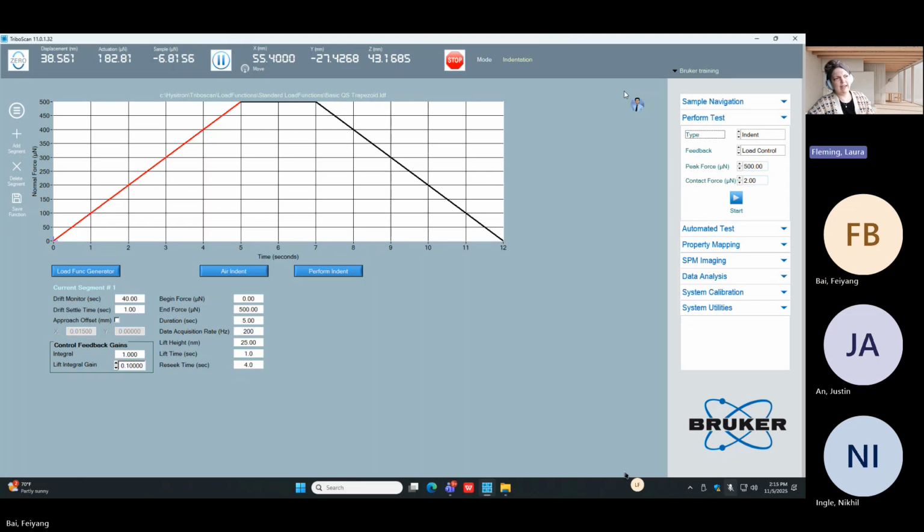It's basically just imaging at higher force. So instead of just tracing it, you wear away, and you calculate how much material you've worn away. And I can tell you some interesting things. The other secondary reason I don't do it when I'm on site is I really hate the idea of adding additional wear to a customer's probe. That Berkovich probe right now is nice and sharp, and if we do a bunch of wear tests, we're going to blunt it down. So that's my other, more practical reason for not performing wear testing training.